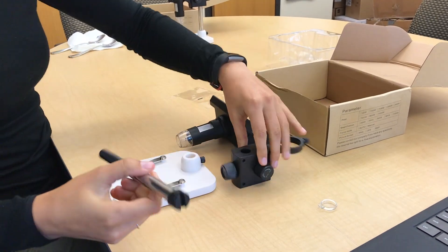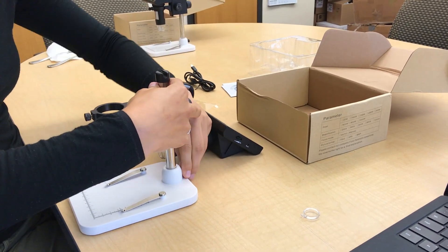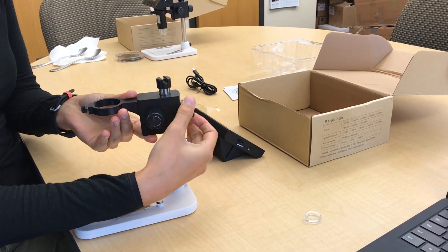Remove all of the pieces and take the lens cover off of the microscope. Assemble it and turn it on by holding the power button down until it lights up.